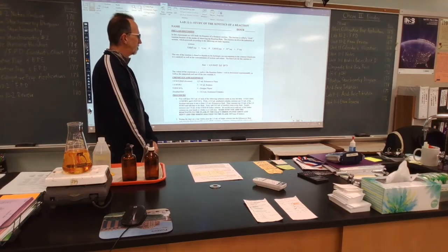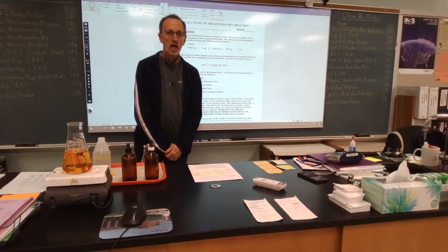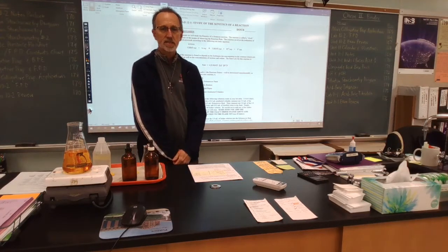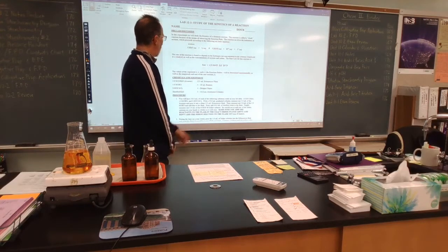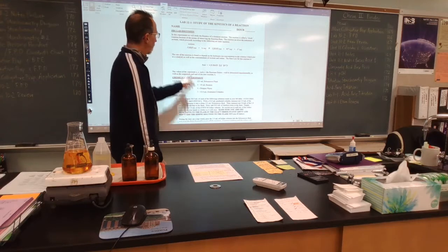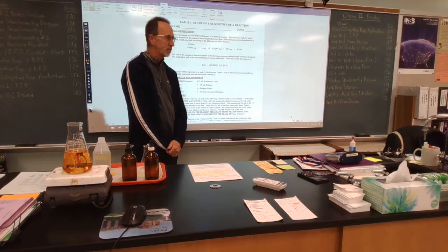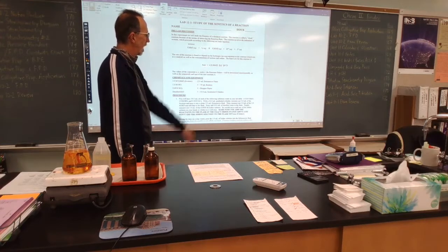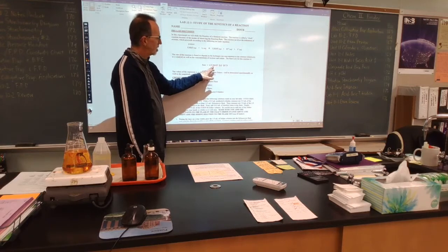The hydrogen ion concentration in the solution, since HCl is in this solution, which makes it acidic, also acts as well as the concentration of acetone listed here. So the rate is equal to k times acetone or propanone to a power.